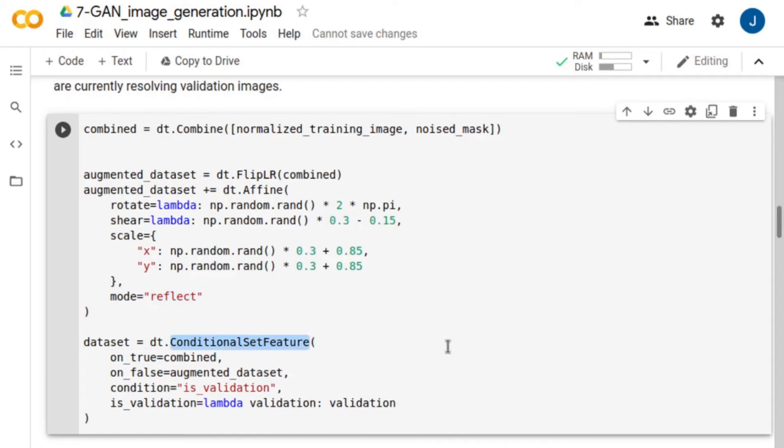Finally, we conditionally skip the augmentation step if we are currently resolving validation images by using conditional features. If we are training the network, we use the augmented dataset. Otherwise, we use the combined dataset.